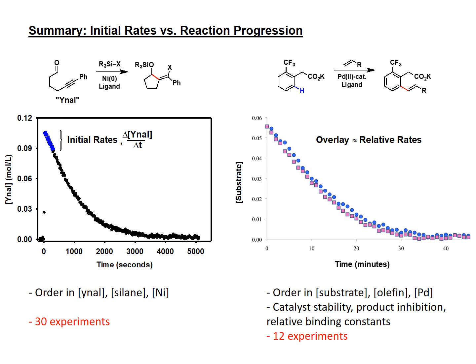And so now I'll just sort of leave it to you. If you have the technology to do these in situ measurements, you can do either one. If you're more comfortable with initial rates, that's fine. Nobody's going to tell you not to do it. But if you have data that's this rich, you can get a lot more information in fewer experiments. And I, as a graduate student, had this information and didn't use it. It just went by the wayside. So I would argue heavily for doing this and just push your time axis around until they fit.